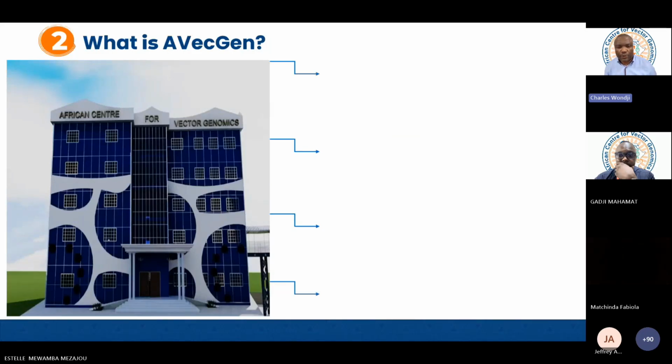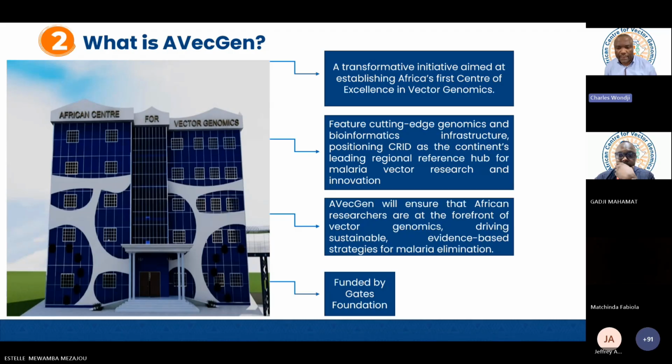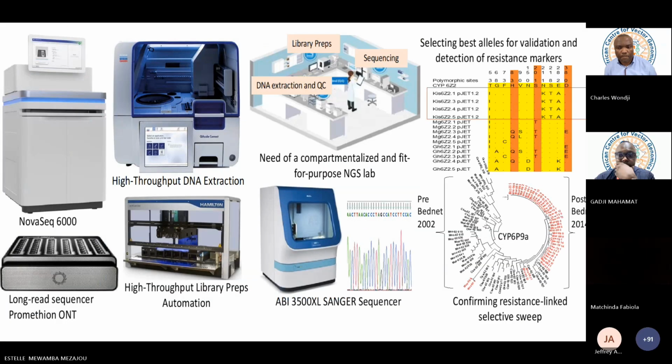Next, please. I don't need to go into this. The next, please. Yes, this is the slide I wanted to show, that we want to cover all this. We already acquired the NovaSeq, which is a powerful next generation sequencer from Illumina that will sequence the human genomes. You can imagine it's a large genome, 3,000 megabases. We are starting the next generation sequencing very soon.